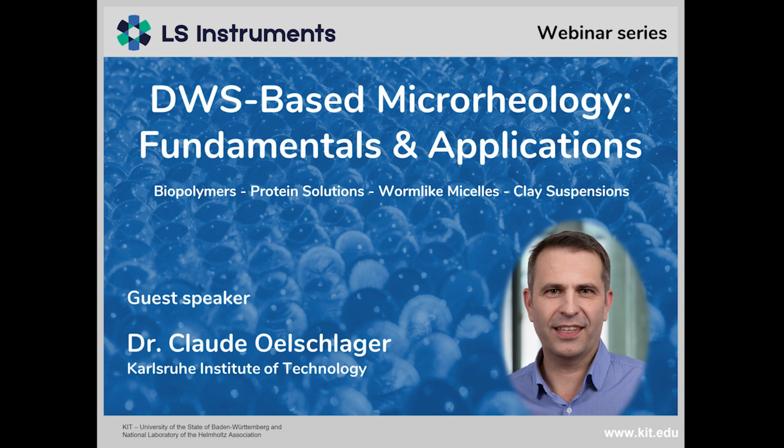So as said previously, today I will give an overview of the work we have performed since a long time ago using this so-called DWS technology, for diffusing wave spectroscopy. We apply this technique to different materials, and I will show you how we deal with these results, how we get information which is very important for these very different types of materials.